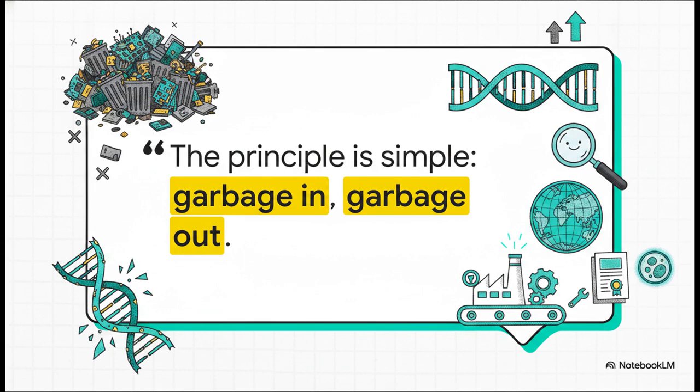This brings us to a really crucial point made by the researchers. It's basically the golden rule of bioinformatics: garbage in, garbage out. Quality control is hands down the most important step you can take. If your raw sequencing data has hidden problems, literally every downstream result you get is compromised. Skipping the quality control step could lead to weeks of wasted time, a retracted scientific paper, or worst of all, a false medical discovery. That makes our inspection phase the absolute most vital part of the entire factory.